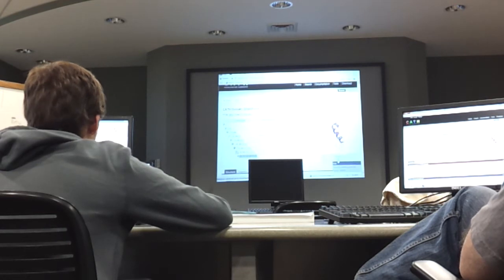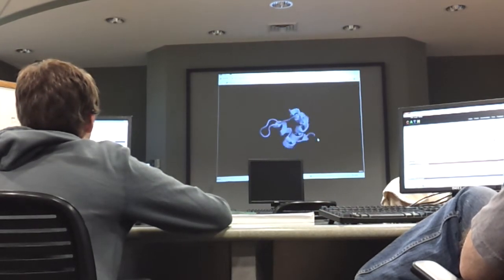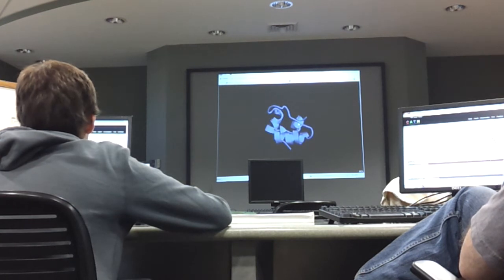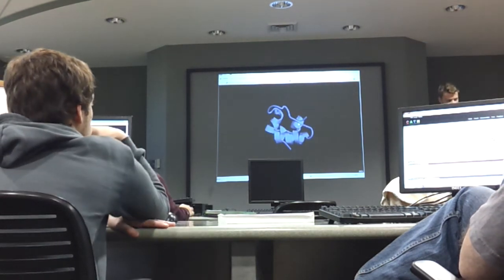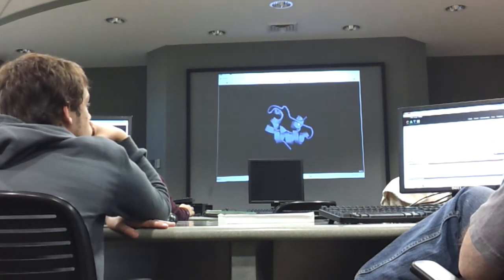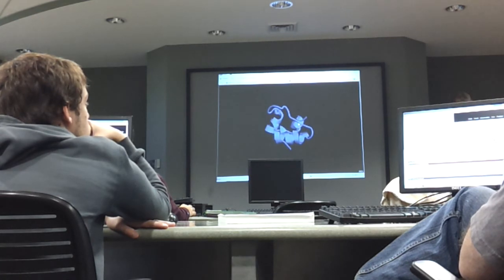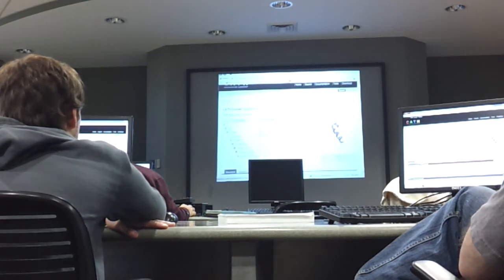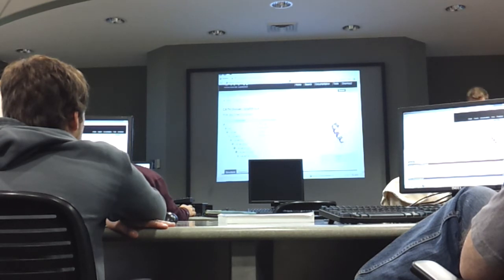And if you click this little triangle on the bottom, you can actually see it, similar to PyMOL kind of thing. And if you're doing a lot of research, especially if there's an epidemic and you don't know what you're dealing with, if you do get the sequence, you can run it through the database. If I didn't know what the sequence was at all, I would run it through the database and it'd say insulin-like, subunit E insulin-like. So I have a pretty good idea that it has a lot to do with sugars and just sending the signal to break down sugars inside the cell.